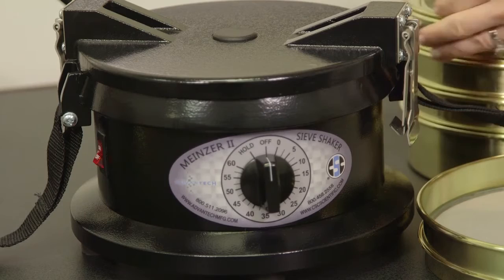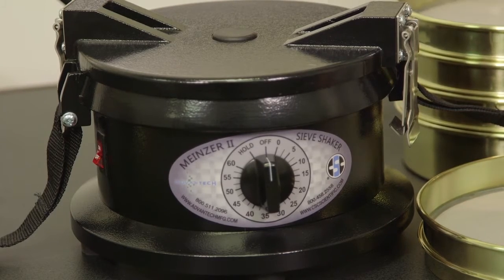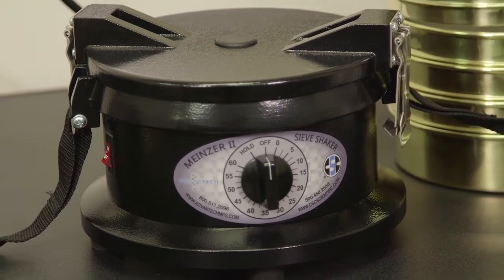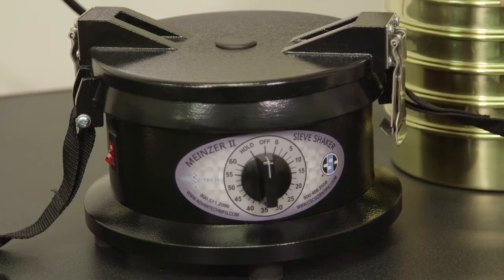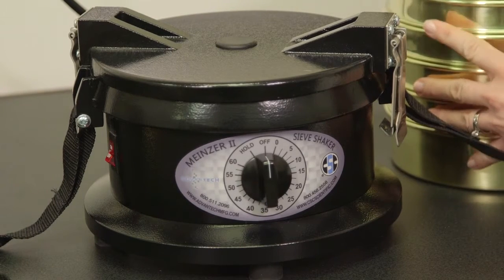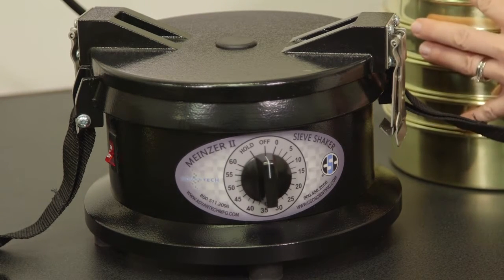Installation is easy and there is no calibration or physical mounting necessary. Simply position the machine on a level, sturdy surface to ensure the even distribution of the sample over the sieve screen surface.